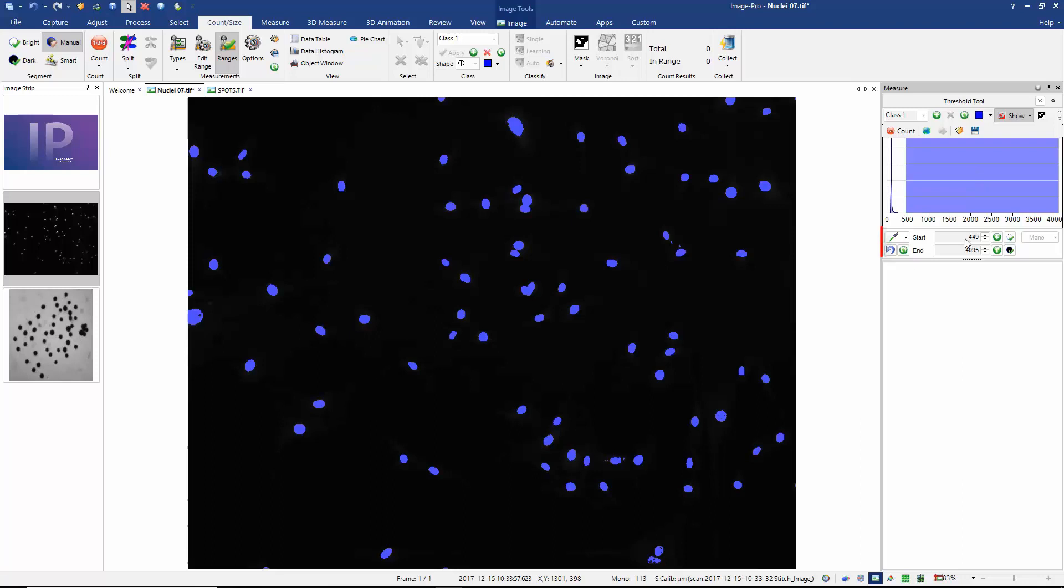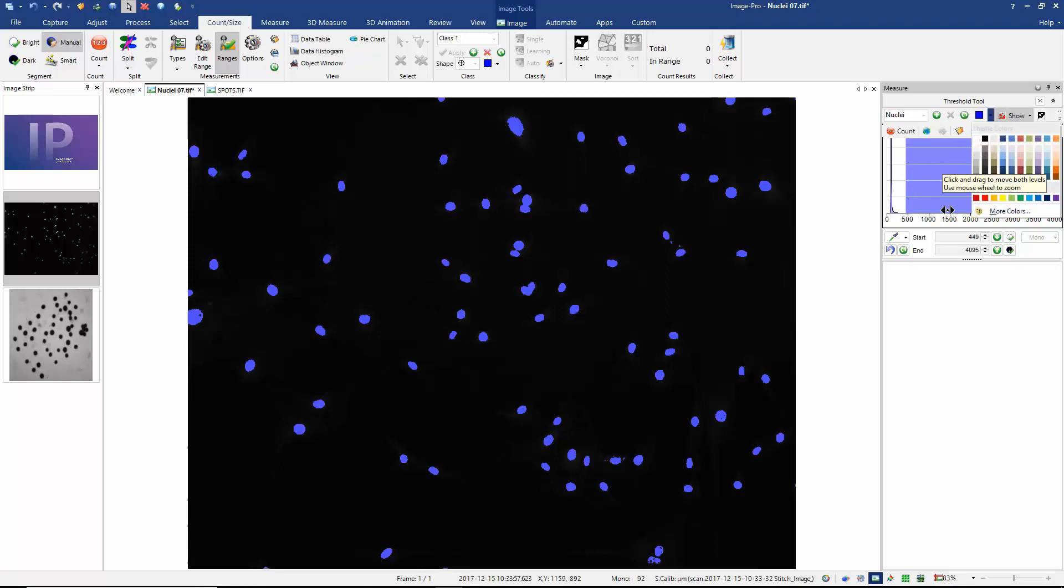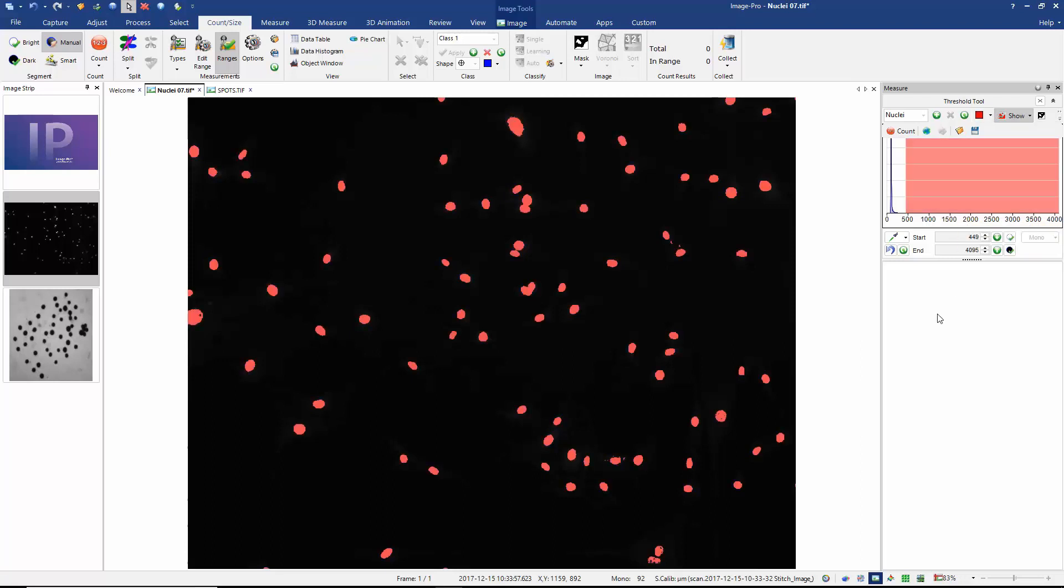I could also, if I wish, manually enter the lower threshold in this text field. I can also change the name of my object class. So let's change this from the default name of class 1 to nuclei. And I can change the colour with which my objects are displayed. So let's display them in red. And at this point, I can press count.